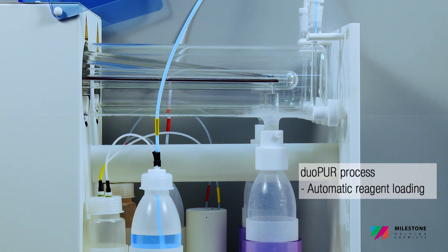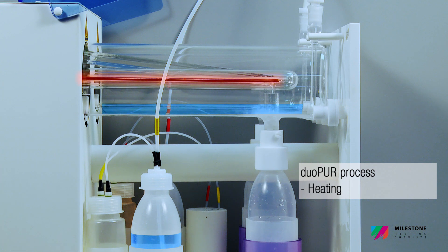Unlike conventional distillation, sub-boiling distillation prevents the formation of spray or droplets and yields very high purity acids.